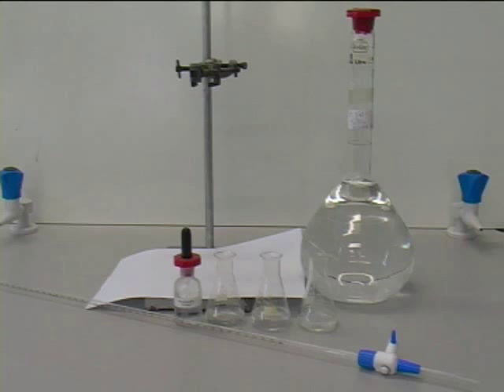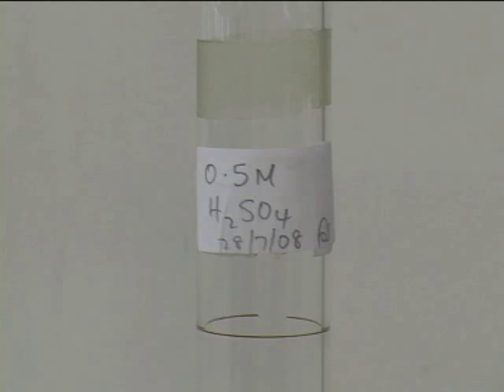Here is the equipment used in titration. You should use a stock solution of a known concentration. The stock solution will be put into a burette.